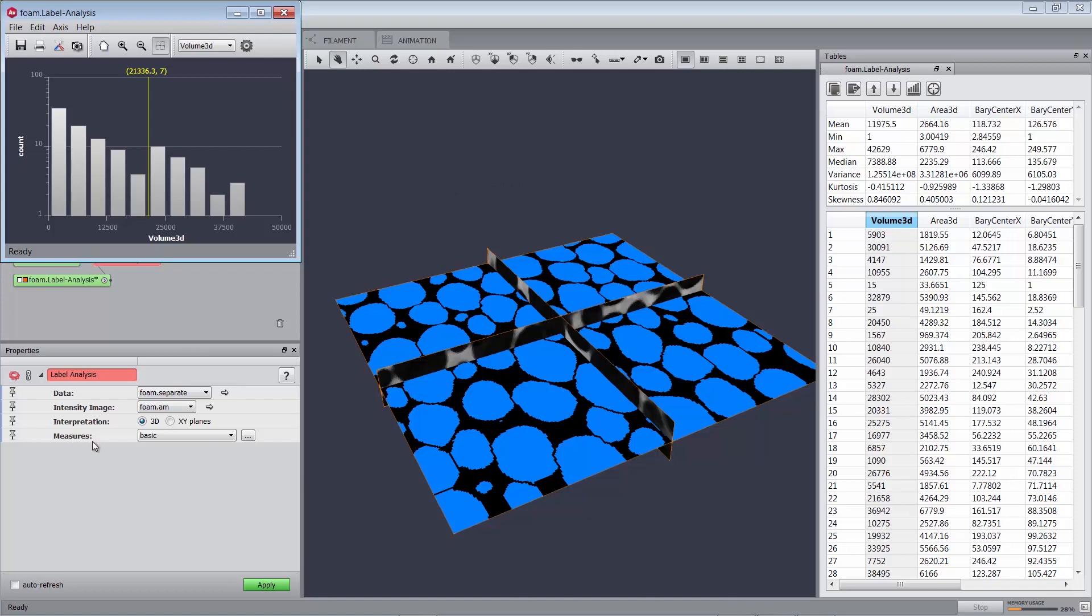In the Measures port of the Label Analysis module, Basic is a group of measures that contains the most commonly used measures: Volume 3D, Area 3D, BaryCenter X, BaryCenter Y, BaryCenter Z, and Mean. It is also possible to define new groups of measures, composed of predefined measures, but also of user-defined measures, but details about this would exceed the scope of this tutorial.